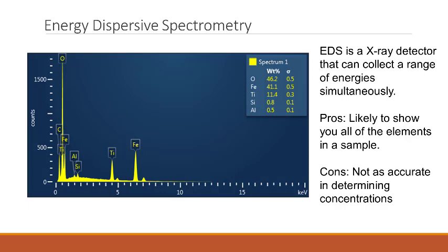For example, if you look at this spectra on the left, you'll see that there are strong peaks for iron and titanium and oxygen. There are also peaks for carbon, aluminum, and silicon. One thing to note, though, is we coat the sample in carbon so it can conduct electricity. So this carbon has nothing to do with our mineral. It is simply a thin film on top of it. However, the other elements are real and producing X-rays.